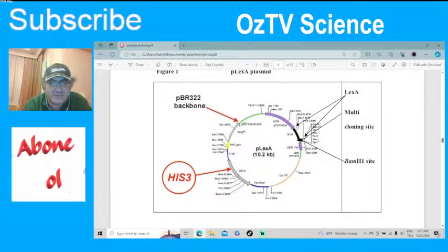This is part one of the two proteins, and then you insert your protein of interest here, into the multicloning site, with this restriction enzyme, BamHI endonuclease, and then you can insert your gene of interest here and generate your hybrid protein. Protein A, protein B, fused together.